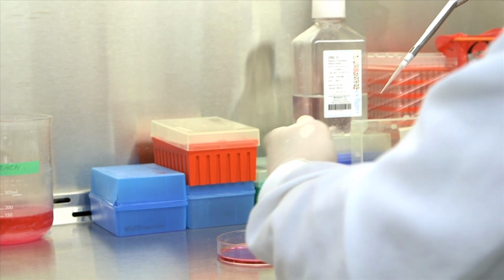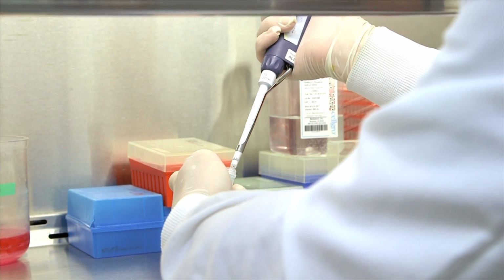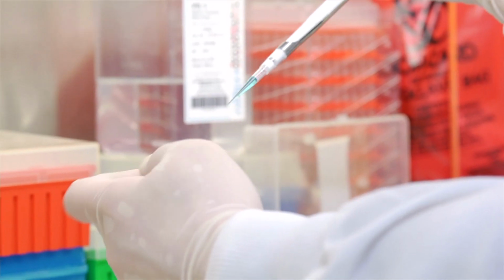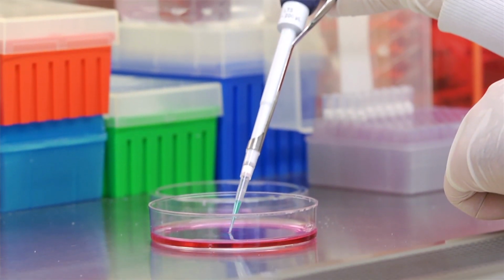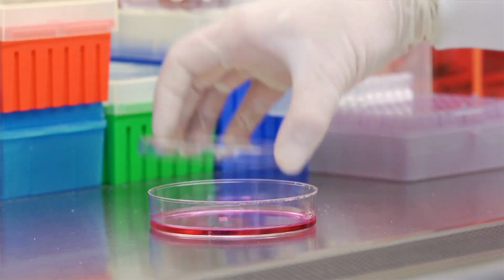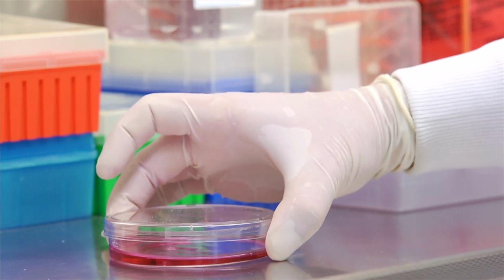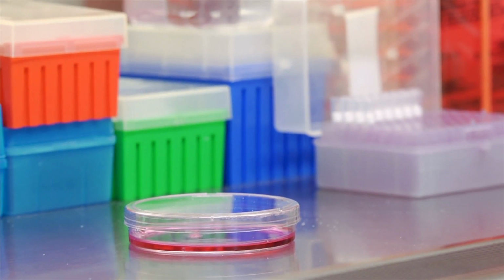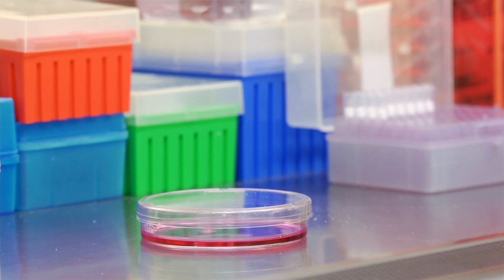Start with a tissue culture dish with cells. Let's say our 10 cm tissue culture dish contains a monolayer of 4T1 tumor cells. Reconstitute the probe according to the recommendations in the datasheet. Add the reconstituted agent to the tissue culture plate, so the final effective concentration in the cell media follows the recommended guidelines. Gently swirl the plate to mix the agent with the media and place the plate in an incubator at 37 degrees Celsius for the recommended incubation time. These times often vary, but in our case we incubate overnight.